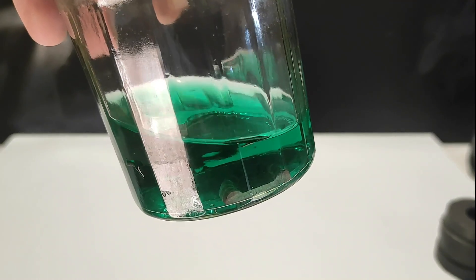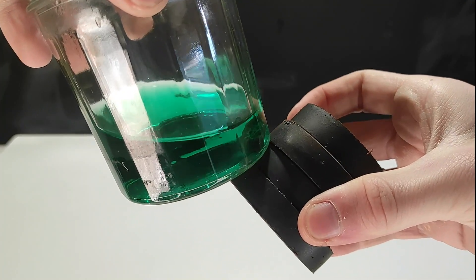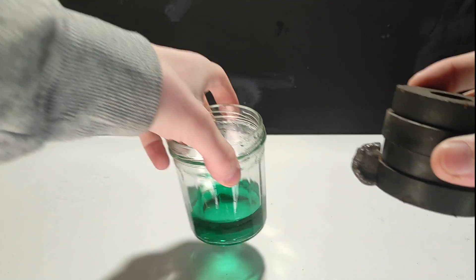The entire metal did not dissolve so I decided to stop. Nickel is one of the only ferromagnetic metals at room temperature, meaning it's sensitive to magnets like iron — and that's how I removed it.